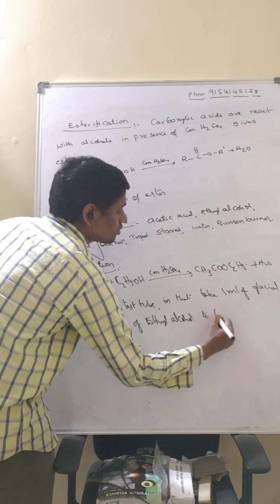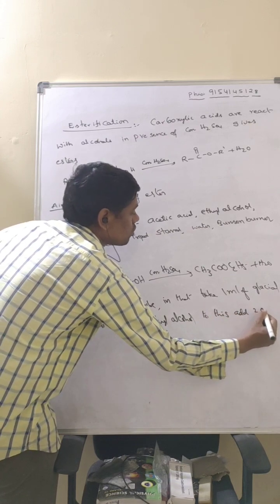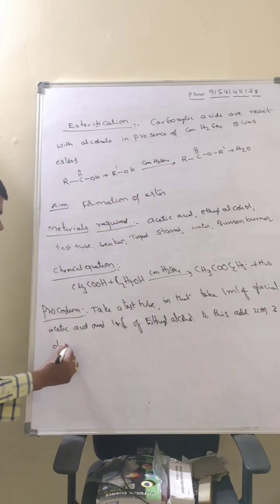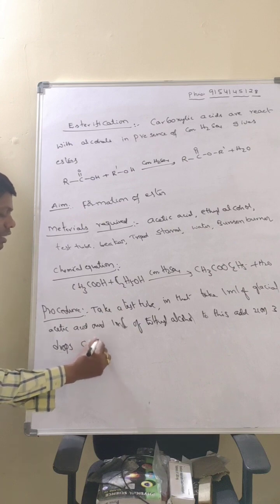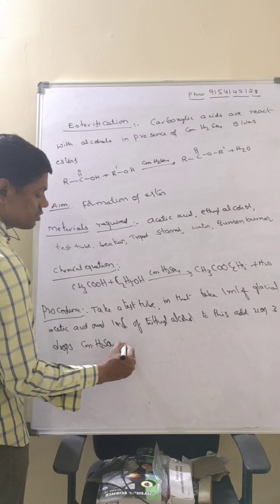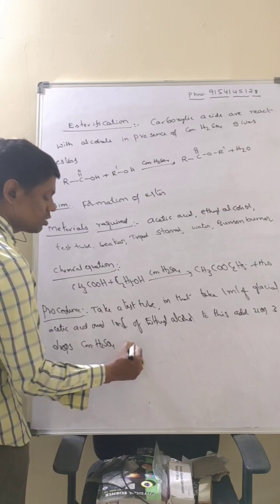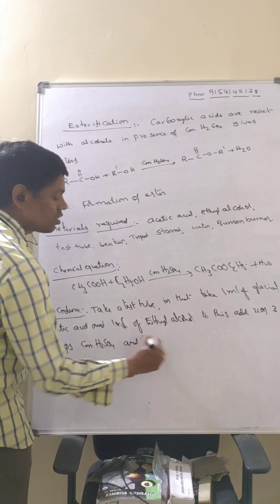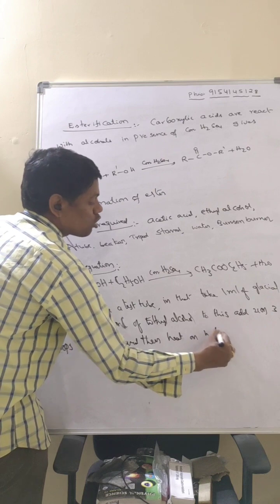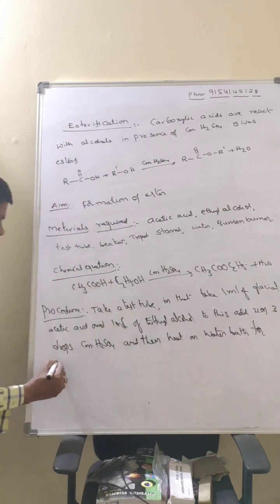To this, add 2 or 3 drops of concentrated H2SO4 and then heat on water bath for a few minutes.